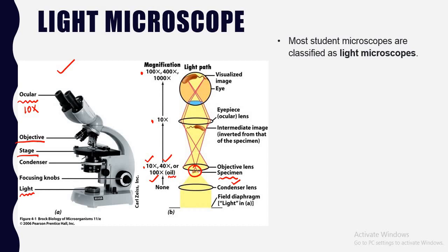There are just 3 types of lens: condenser lens, objective lens and eyepiece lens. The objective lens will help in magnification. The condenser lens will allow all the light to gather at one point, that is on the specimen. The eyepiece lens allows us to observe the image which is formed. How the image is magnified? Please check part 1.